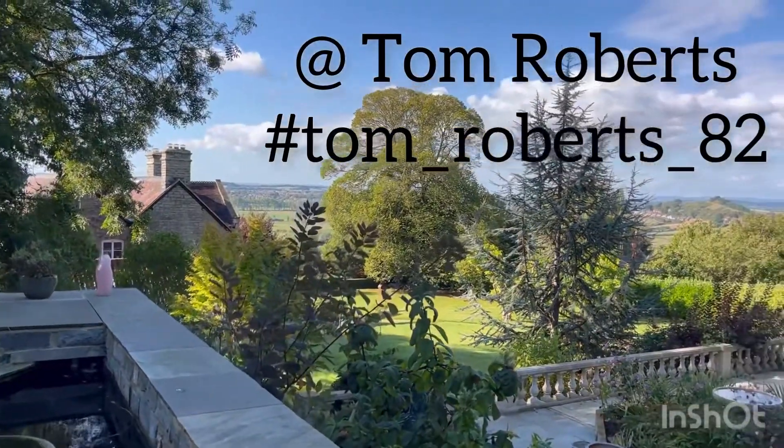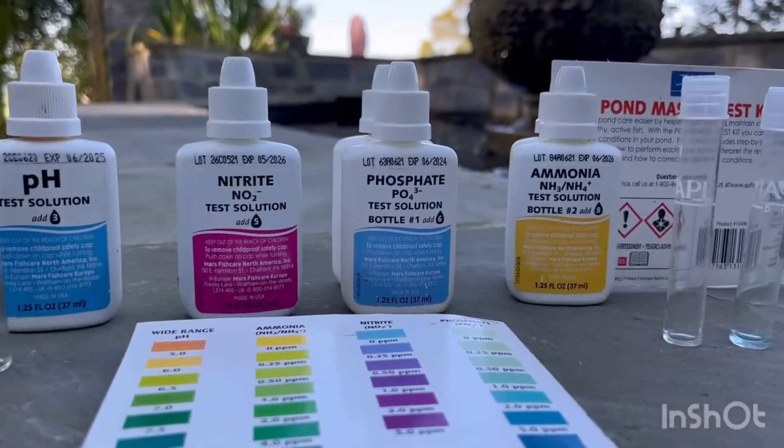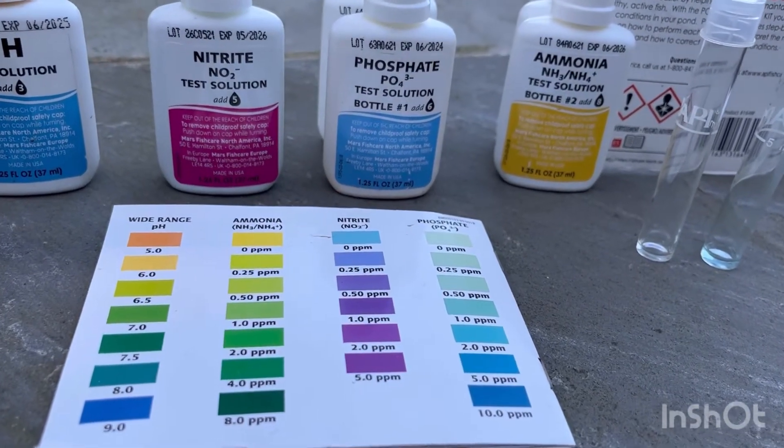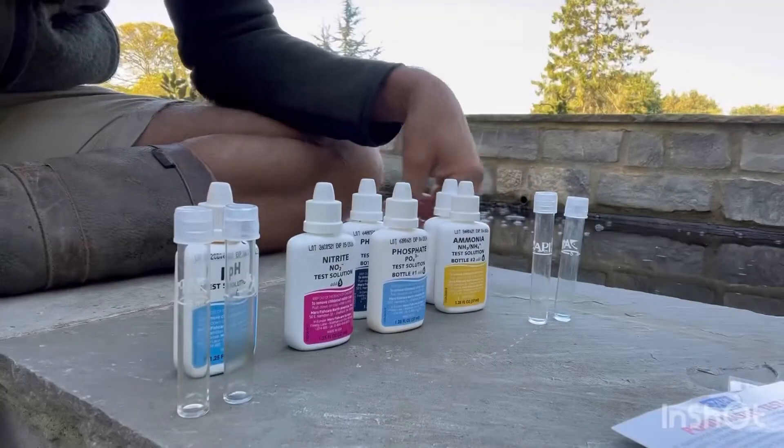We build a koi pond so it's part of the landscape. Today we're going to be using the API master test kit to test pH, nitrite, phosphate and ammonia. So let's get on with it.